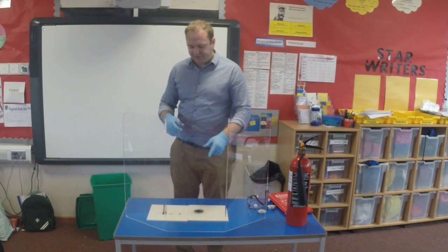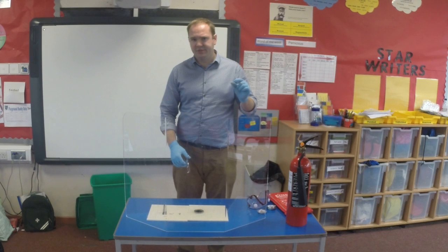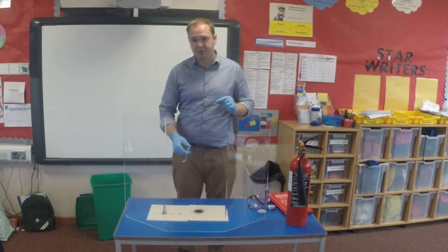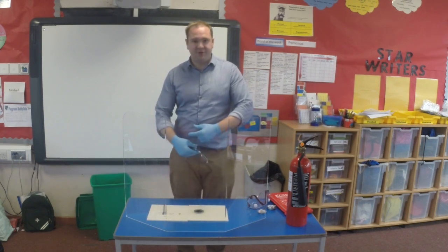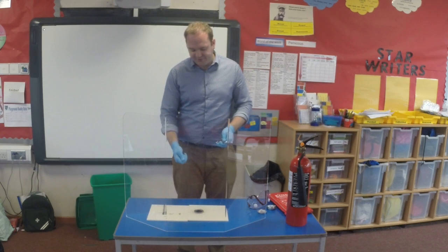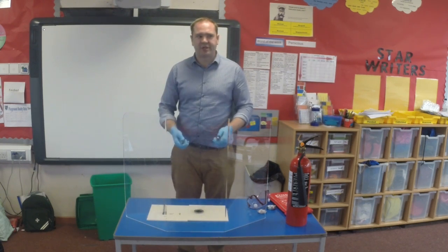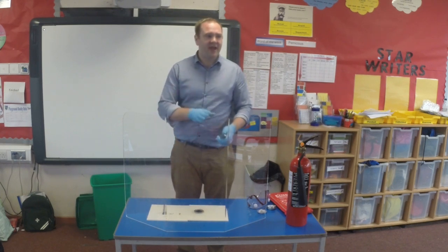Another way of disposing of it is to dilute 5 grams of this in 2 litres of water. So if I've used 15 grams, I would have to use 6 litres of water. Now that's not a small amount of water. So every 5 grams in 2 litres of water, mix it in, make sure that it's not reacting, and then it can go down the sink.